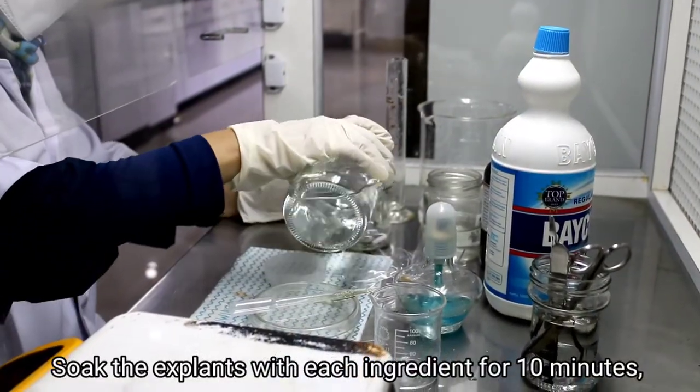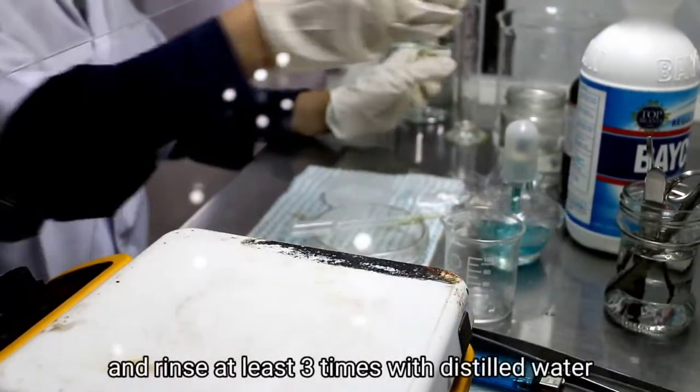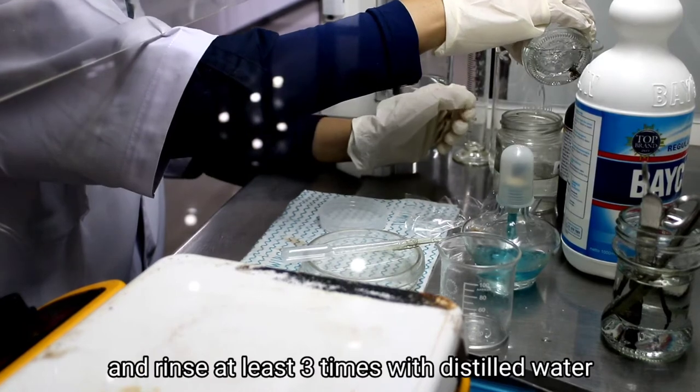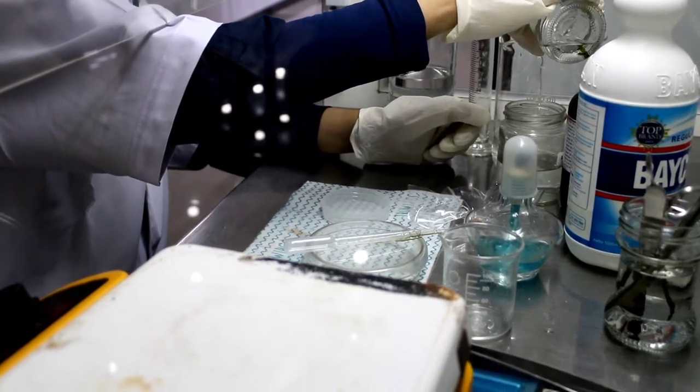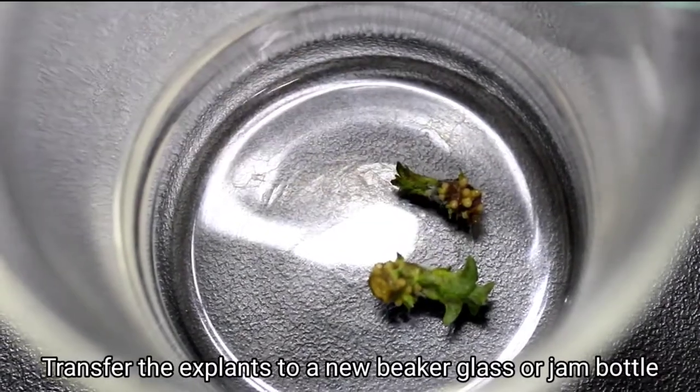Soak the explants with each ingredient for 10 minutes, and rinse at least 3 times with distilled water. Transfer the explants to a new beaker glass or jam bottle.